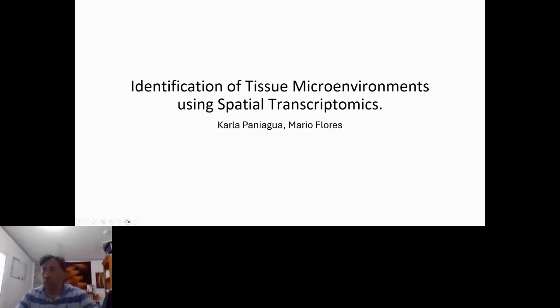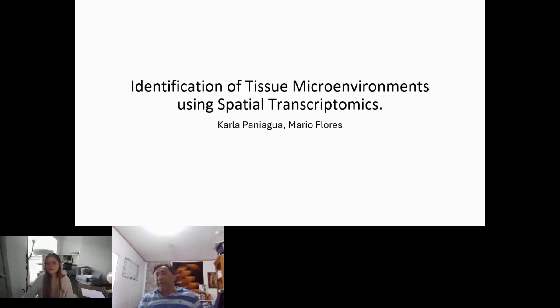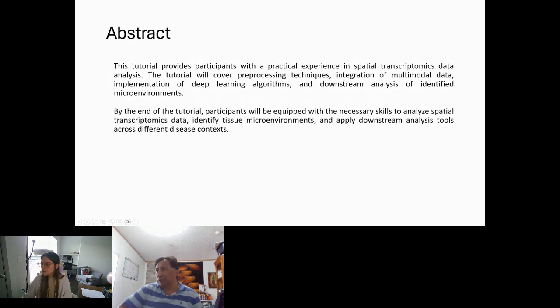And we're going to go through some of the code to make it easier for you. We will identify each section of the code. We're going to have three scripts. As you know, in Jupyter, each script has a different section. We call it a section or number that identifies the block of code. So we're going to call it script one dash section 1, 2, 3, etc. That is easier for you to go through the data and the scripts, and we identify where you are in the process. So go to the next one, please, Carla, and let's get started with this tutorial.